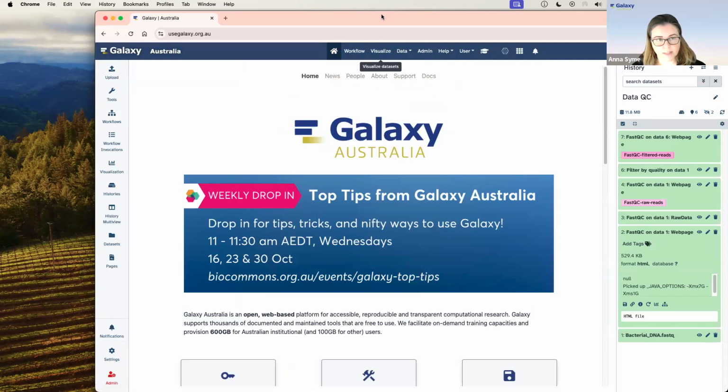So you can create them from the canvas, you can create them from your history, and you can import them. And really good to remember that you can change them. So you can always import one that you like most of it, and you can change it as you need it.